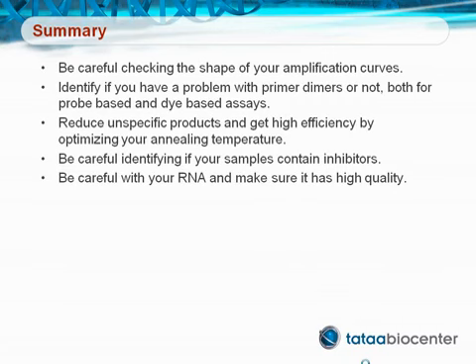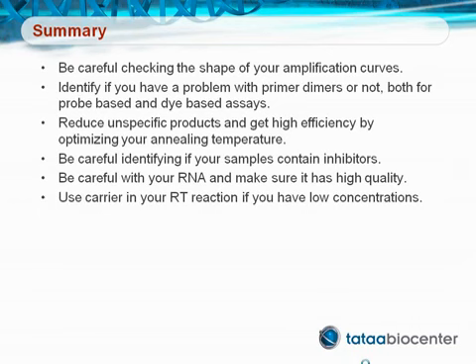Be careful with your RNA and make sure that it is high quality. And in the end, use a carrier or, for example, the dilution buffer from Takara in your RT reaction if you are working with low concentration samples.